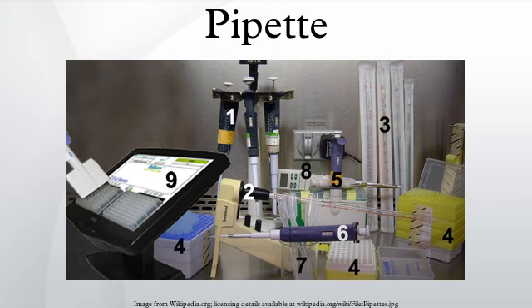Extremely low-volume pipettes. A zeptoliter pipette has been developed at Brookhaven National Laboratory. The pipette is made of a carbon shell, within which is an alloy of gold germanium. The pipette was used to learn about how crystallization takes place. Robots. Pipette robots are capable of manipulating the pipettes as humans would do.